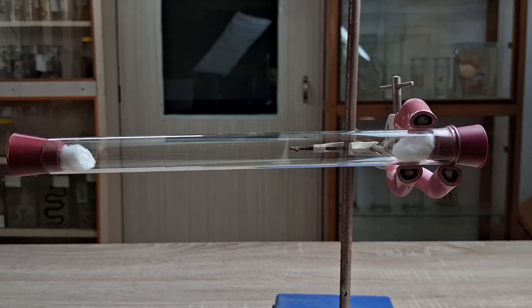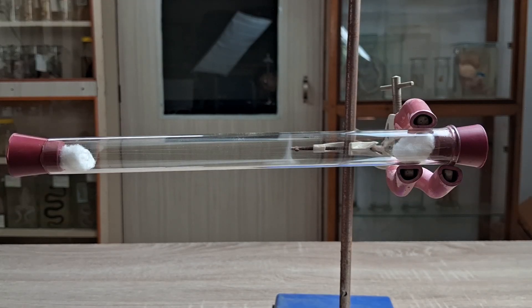As the reaction progresses, this cloud ring increases in area, travels closer to the hydrochloric acid cotton ball, and eventually begins to spread throughout the inside of the tube.